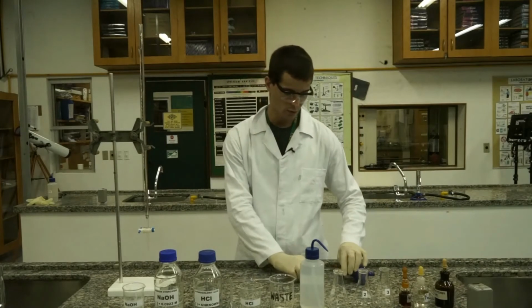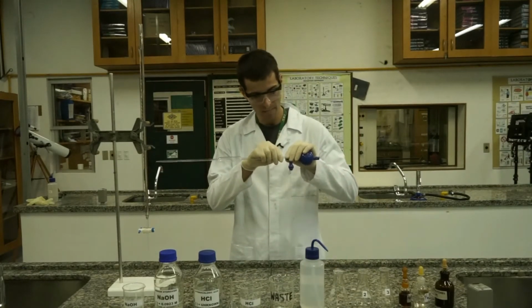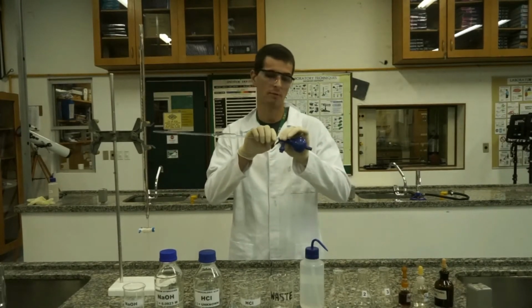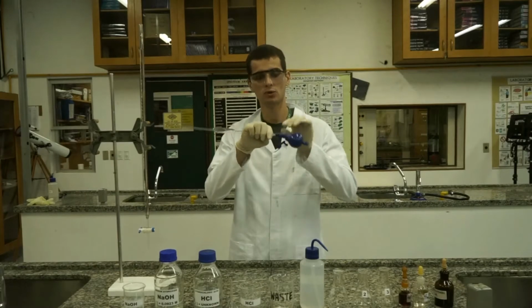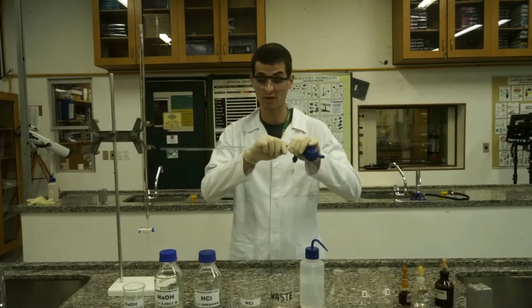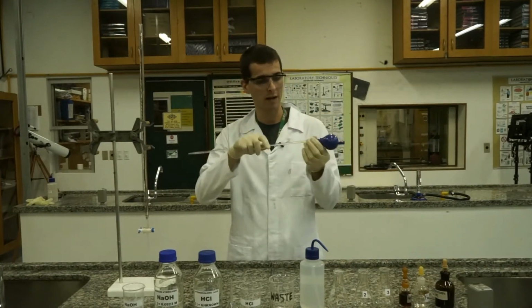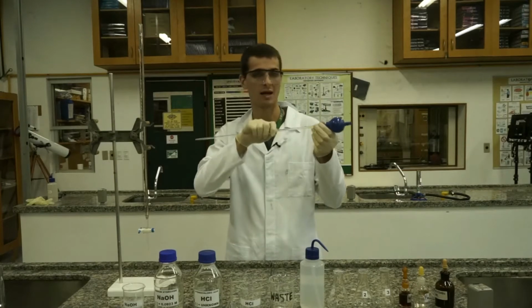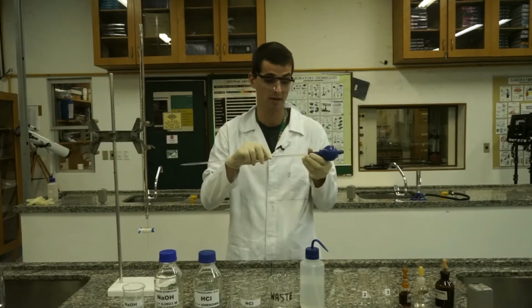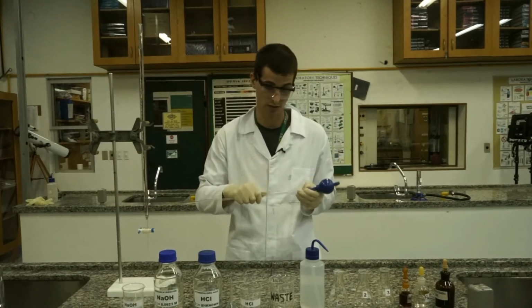Now, I'm going to insert the pipette filler here. Be careful. Always hold the pipette as close as possible to the tip where you will insert the pipette filler. Never hold here in the middle, because if you apply too much force against the pipette filler, you could break the pipette and the glass could seriously hurt you. Never do that, okay?